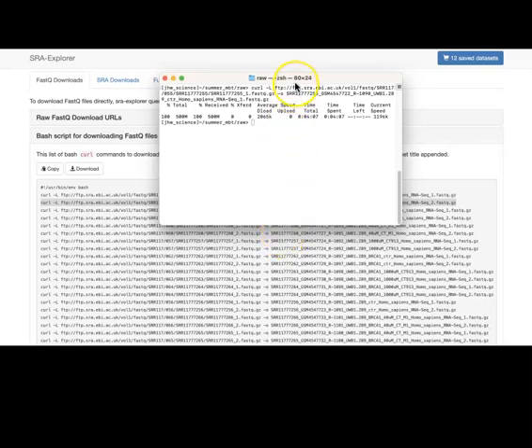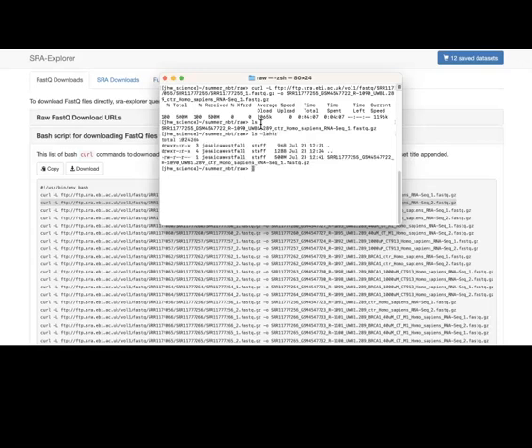So let's come back to this window right here. We can see that our file has downloaded 100%. So if we go ahead and type in ls, which is for list, we can see the file is listed right here. Actually, I'm going to do ls -l, this just provides me more information. So this is the file that we just downloaded, and it tells you how big the file is, as well as who the owner is and permissions, which we can go into further in Unix. But what I want you to recognize is that this right here is just the _1 file.